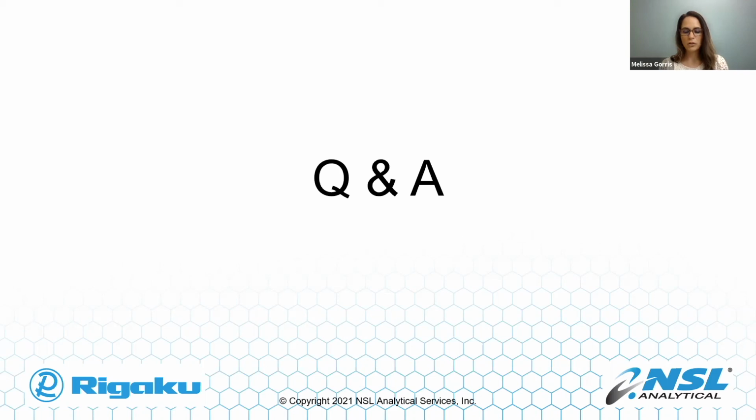Does the software ceramic search option work for all the databases or just the ICDD database? Melissa, can you repeat that question? I thought that was for ceramics. Yes, I'm sorry. For XRD, does the software ceramic search option work with all databases or just the ICDD database? Yeah, that's a very good question. Allow me to quickly show the software because I can't answer this without it. Let me share my screen for answering this question.